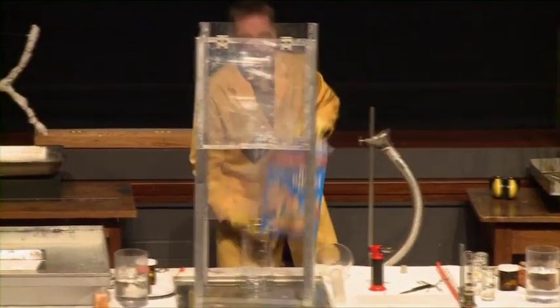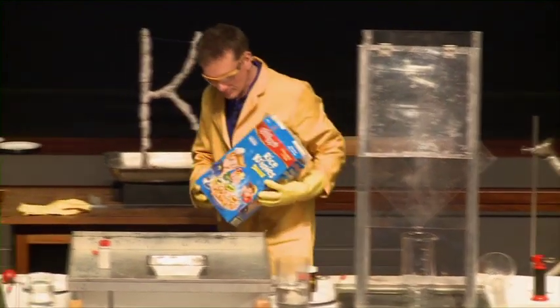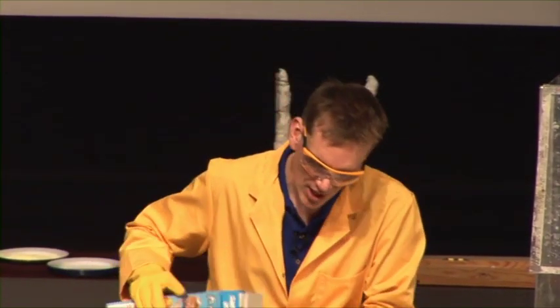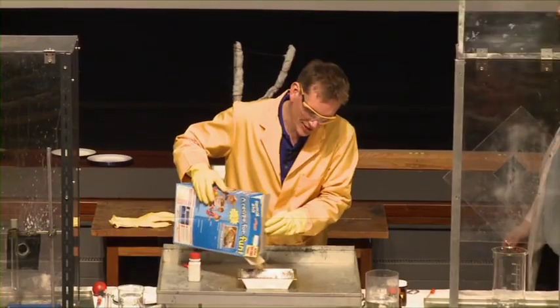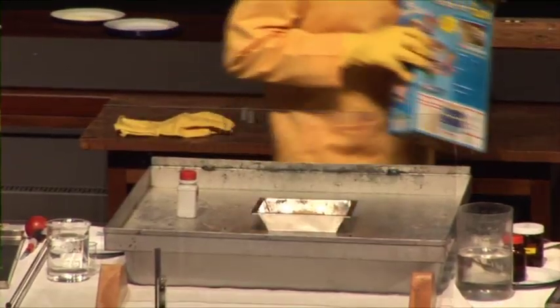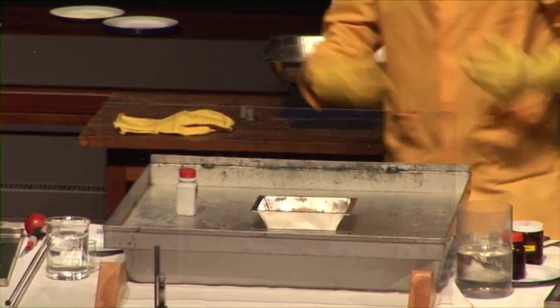How about some Rice Krispies? We get our energy by the combination of oxygen with our food, such as Rice Krispies. So we're going to show exactly that same reaction now — this is our food, Rice Krispies. Add some oxygen.